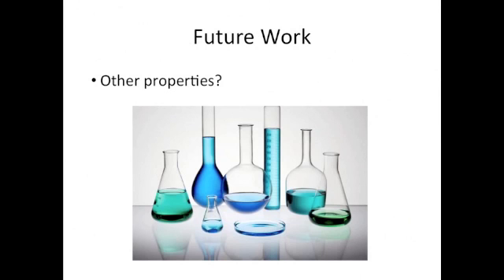Particular substances have very unique properties that allow them to be easily separated and distinguished. Among these are density and specific heat, which were used in this experiment, melting point, boiling point, flash point, or all other specific properties. The purpose of this experiment was to identify an object through the comparison of its properties to that of known substances, so future work may utilize the manipulation of other properties.